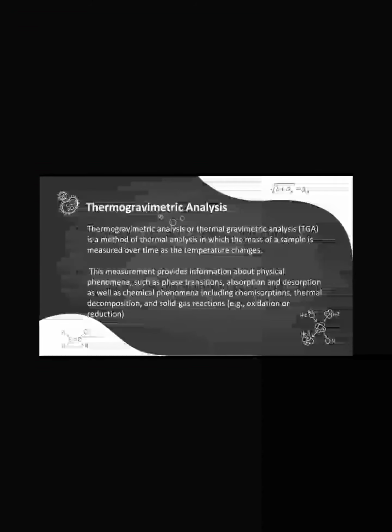Thermal analysis is also often used as a term for the study of heat transfer through structures. Many of the basic engineering data for modeling such systems come from measurement of heat capacity and thermal conductivity. This measurement provides information about physical phenomena such as phase transition, absorption, and desorption, as well as chemical phenomena including chemisorptions and solid gas reactions.